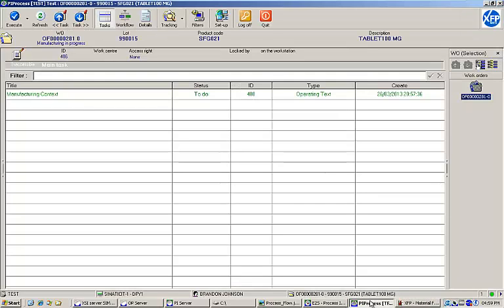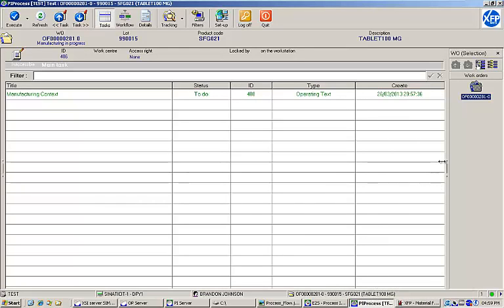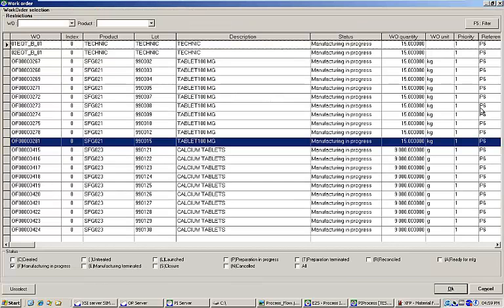Here we can see the EBR execution screen. This is where operators are able to navigate and interact with EBRs during the production process. The Work Order Selection menu on the right-hand side allows the operator to search for and select from any work order that has been launched in the applicable work center.